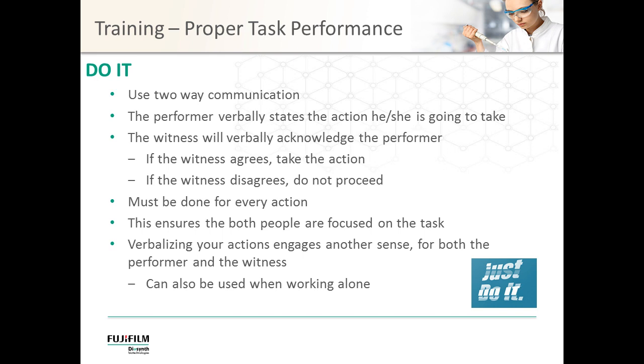During the execution of the step, the performer is waiting on acknowledgement or agreement from the witness prior to taking the action. This acknowledgement from the witness should also include values and unit of measure. If I'm setting a pump speed to 65%, I want to hear the witness agree with the setting of 65% before I do it, then verify that I've set it to 65% after I do it. This keeps both people focused on the task, and it leaves no doubt that the correct action was taken.